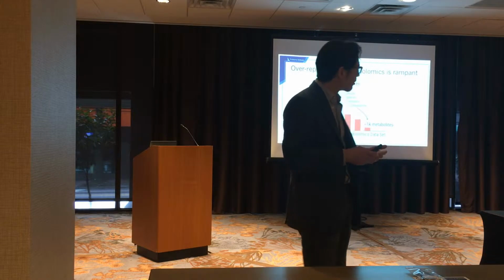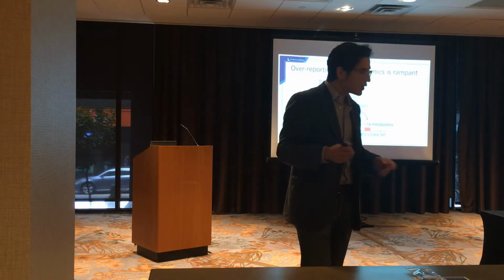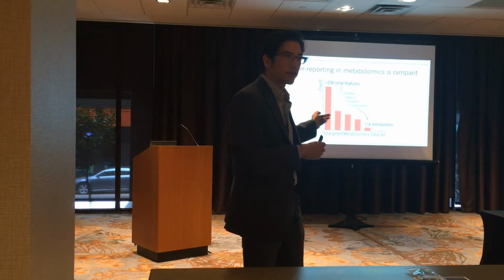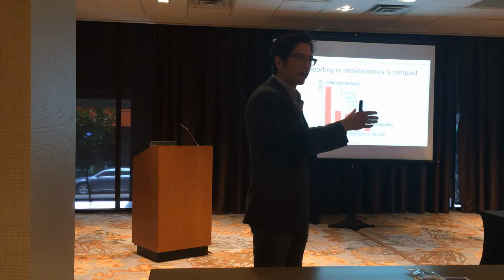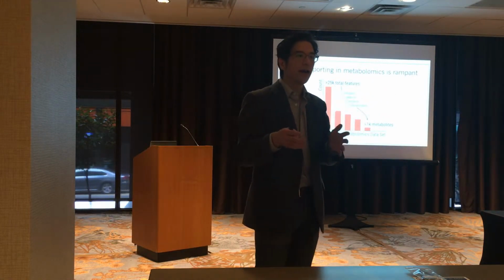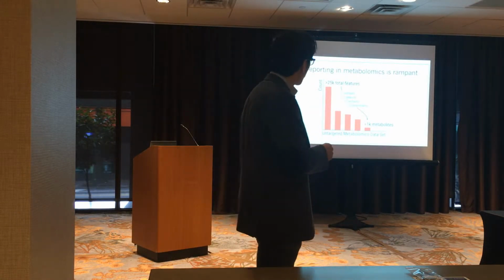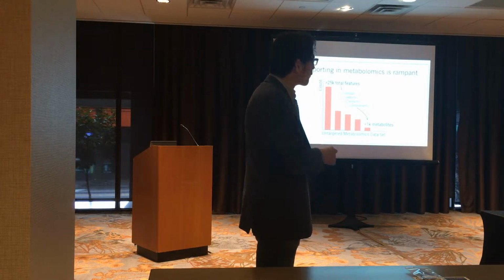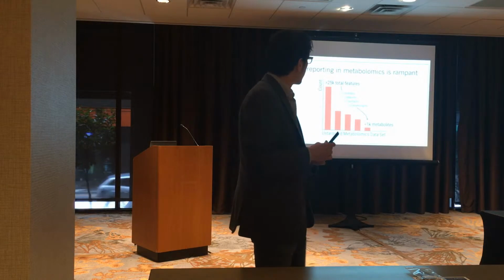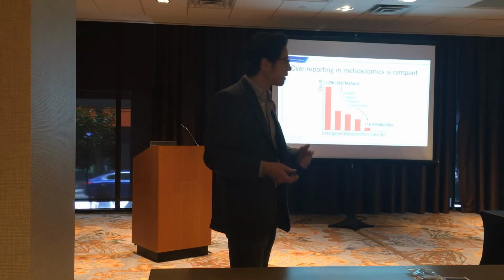The real issue, I think, is hammered home in this paper from Gary Patti's lab. And this is quite recent, right? This is 2017. So this is an issue that we were facing 15 years ago in proteomics that is really trying to be dealt with now in the metabolomic space. He demonstrated in this paper a list of over 25,000 features that were detected out of a single E. coli lysate that were caused by different metabolites in that lysate.